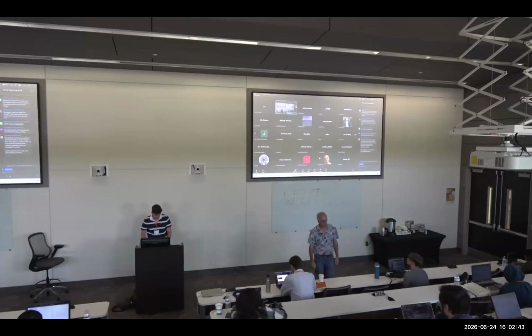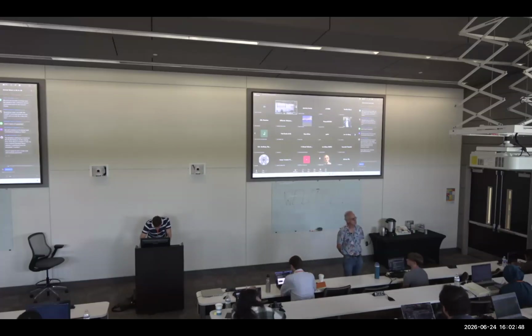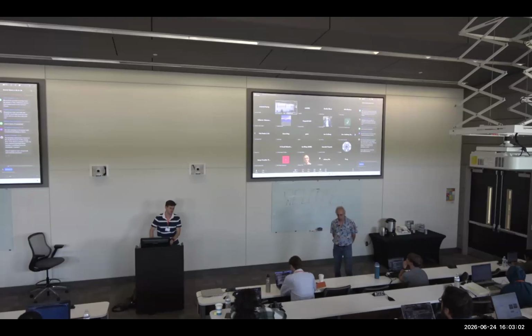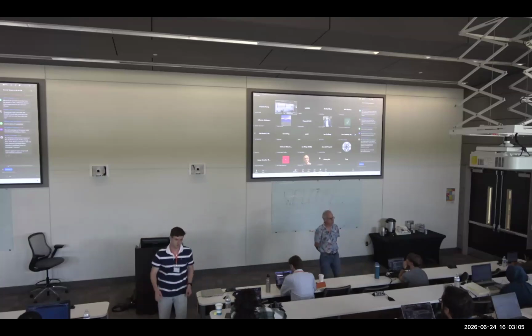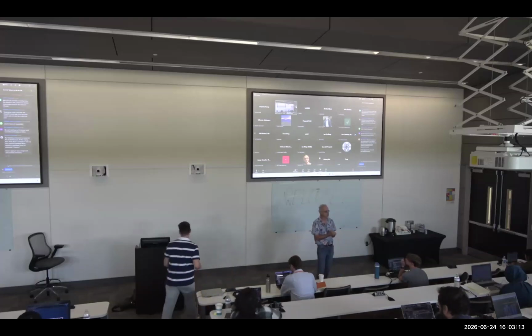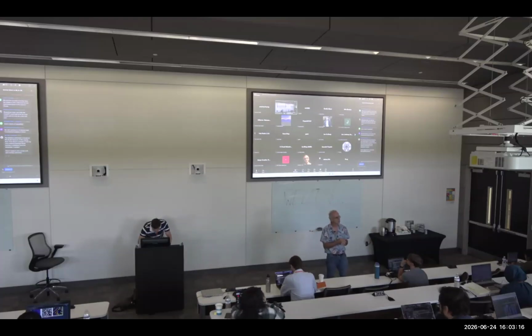So, okay, very good. Another question. For collection angle measurements, if we don't have the calibration way of doing it, can we do it just with the camera length and the GIF aperture measurements, or it's not accurate? For EELS? Yeah, for EELS collection angle. Yeah, so you go in diffraction, as you said, and just look at a diffraction pattern with the same, and then you know how big the entrance aperture, how much you see in the EELS spectrometer, that's what you see, or if you know where it is on your screens, and then you can estimate the collection angle right away.